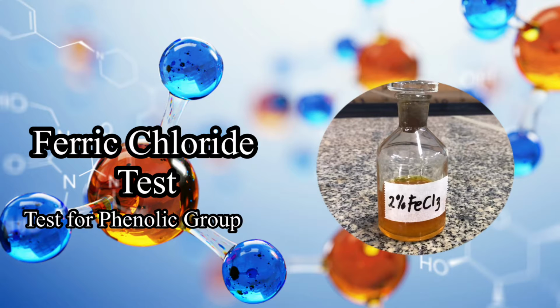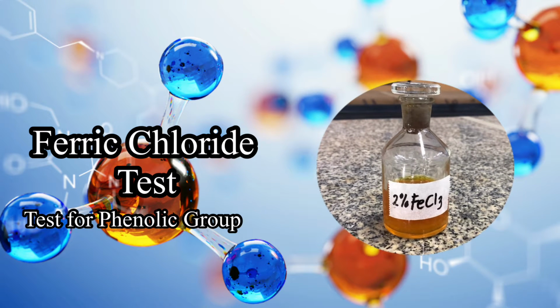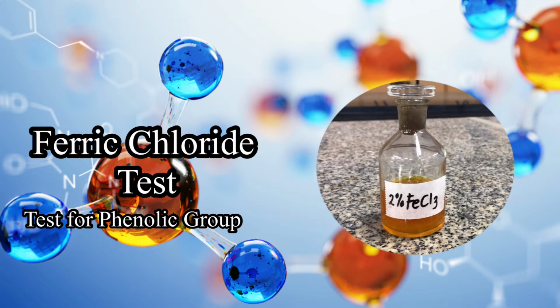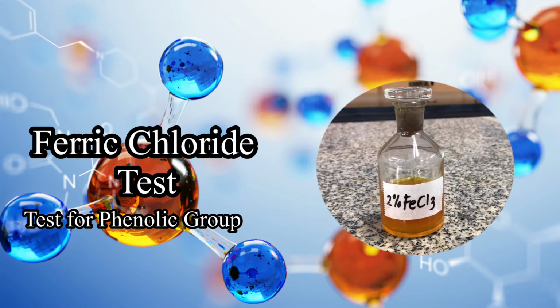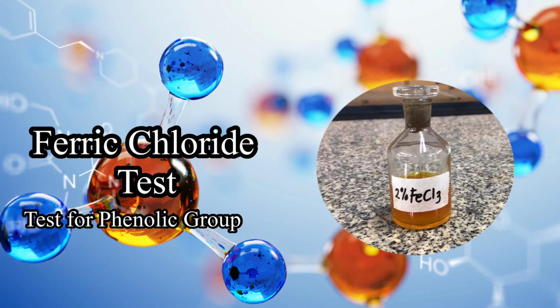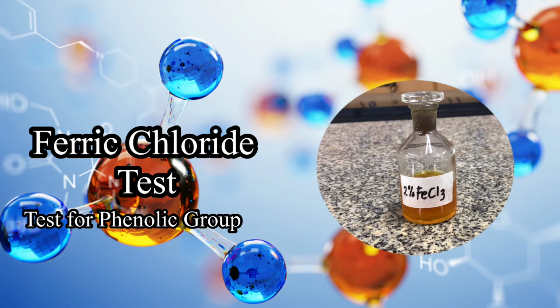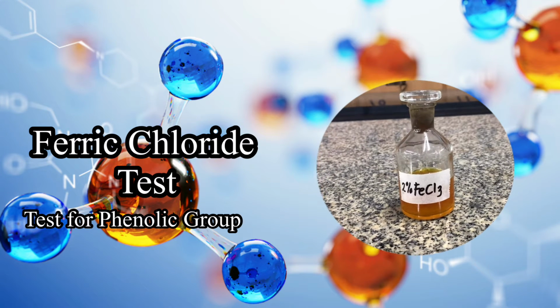The third and the last test is a specific test for the phenolic groups, the ferric chloride test. As the name of the test already implied, this utilizes ferric chloride solution as its reagent. This test is based on the fact that the phenolic groups can form a purple-colored complex with the ferric ions, which cannot be seen in any other compounds containing the hydroxyl group.